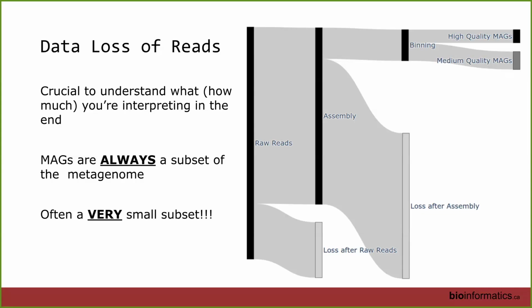And this is not just with low biomass samples. You have to be very cautious with how you quality control and how you interpret. And part of what we're doing today is taking some MAGs and refining them. So that's part of the process that we're going to be looking at too. Yeah.